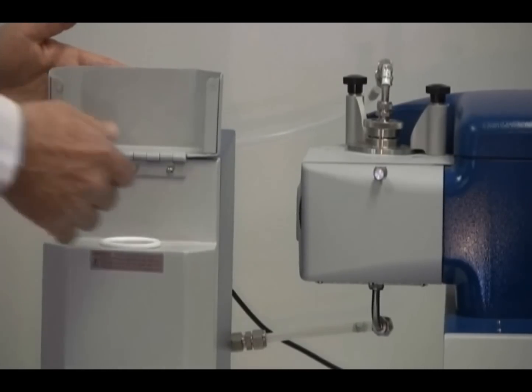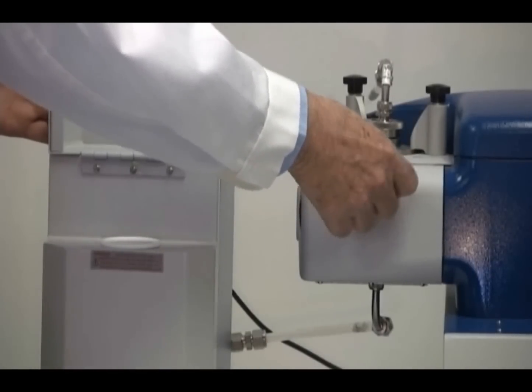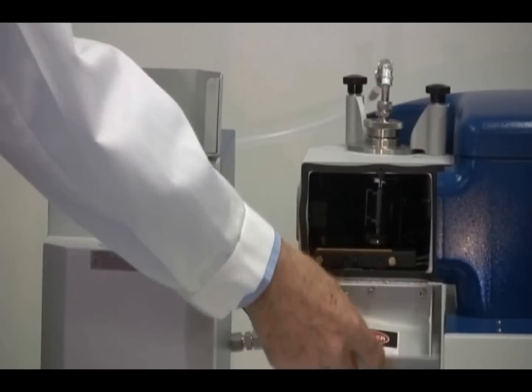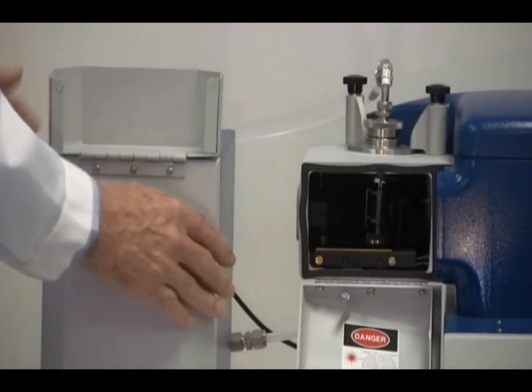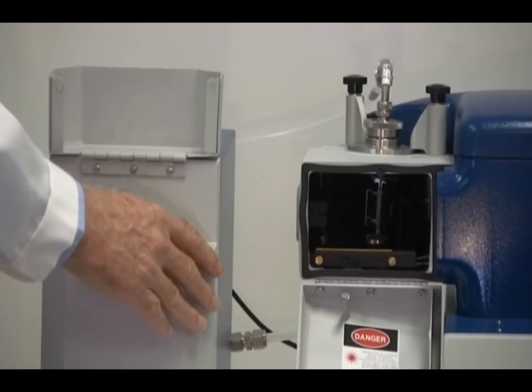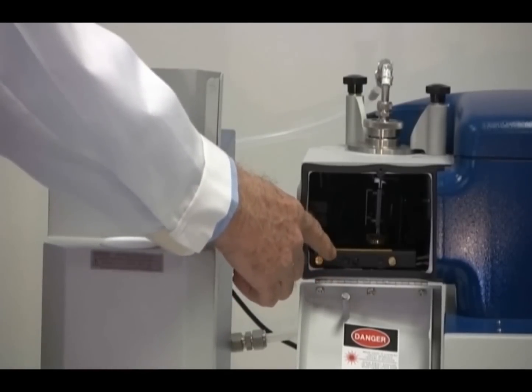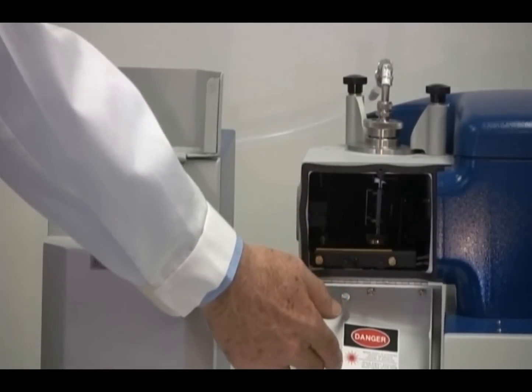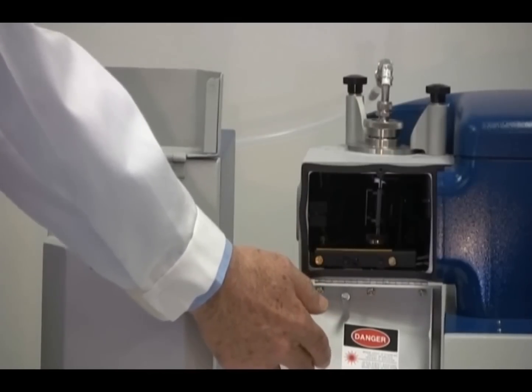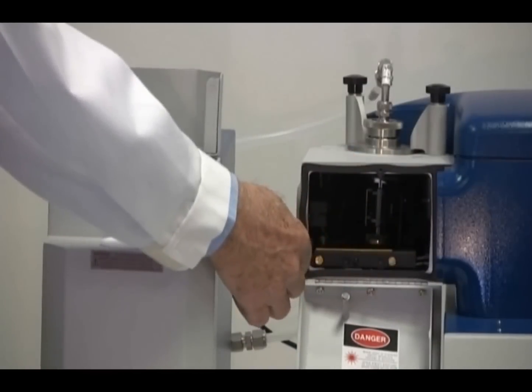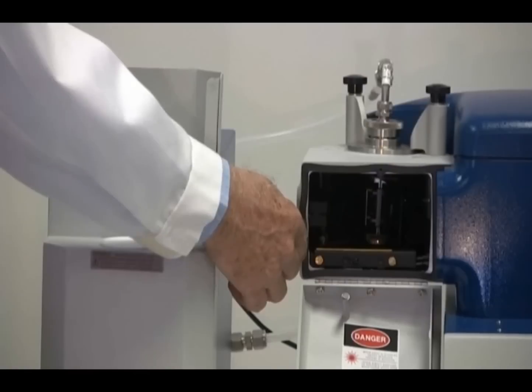To remove the sample cell, turn the knurled screw to the left until the door drops down. There are two things to mention about this area of the instrument. One is that there is a safety laser interlock. This interlock prevents the lasers from turning on when this door is in the down position. The other aspect of this sample chamber is that there is a gasket around the opening. This gasket prevents any dust or dirt particles from entering the optical system in the normal operation of the instrument.